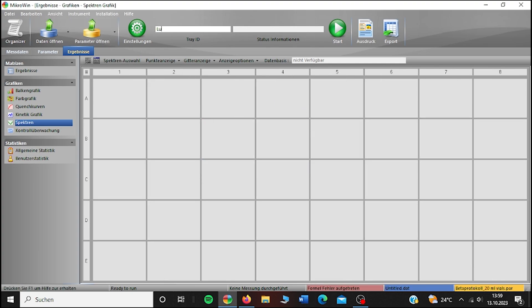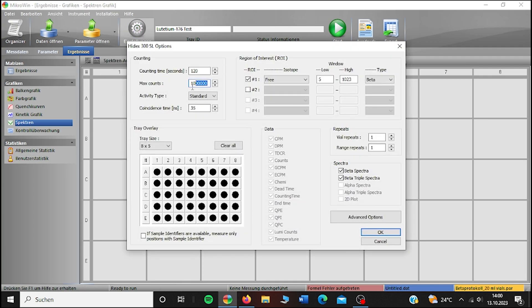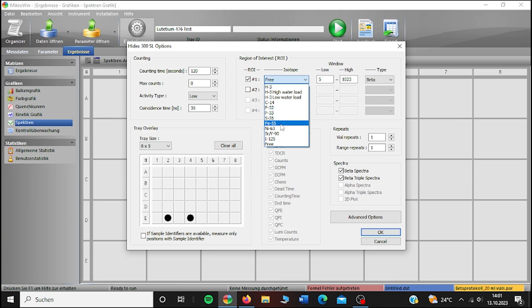Let's name our measurement. Now we have recorded the screen with a long-term lutetium measurement, but that's trivial. Measurement time 120 seconds, activity load to make the measurement more accurate. Only use high activity for standard samples, for example. Now we've got to select where our samples are in the tray, then the ROI can be adjusted depending on the nuclide, but you can leave it as it is.